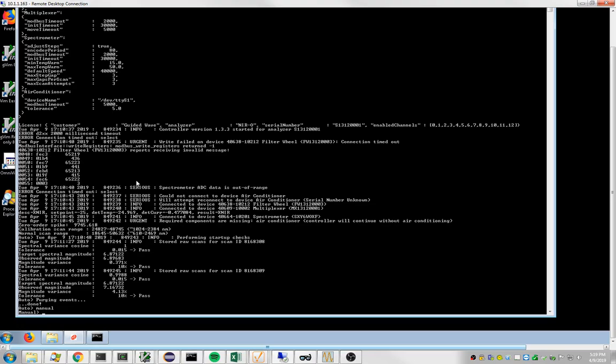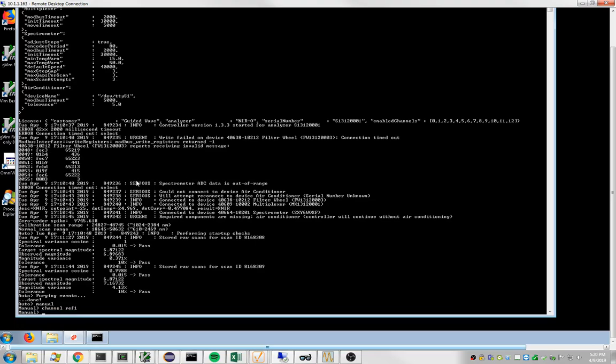We're going to start by calibrating the reference channel, and if that works, then we will calibrate all channels. So to calibrate a channel, we're going to select the channel. We're going to type channel reference 1, and then we're going to type calibrate.